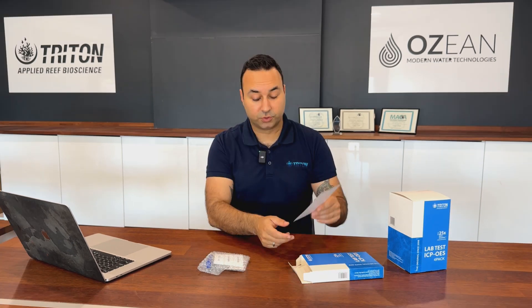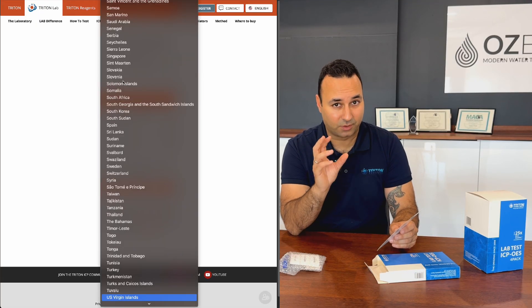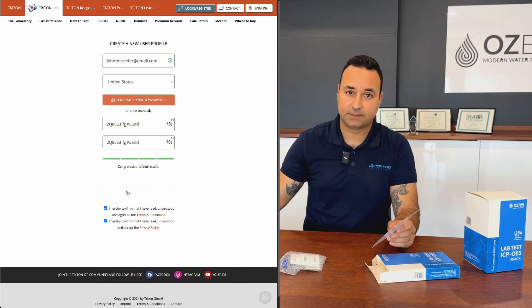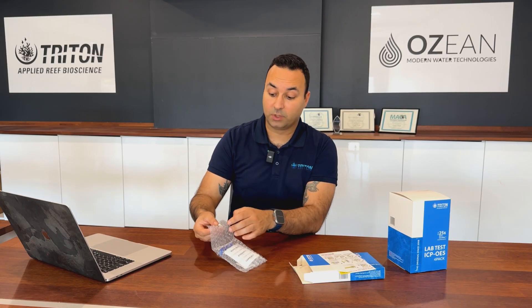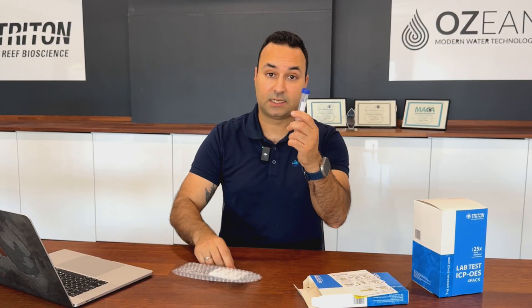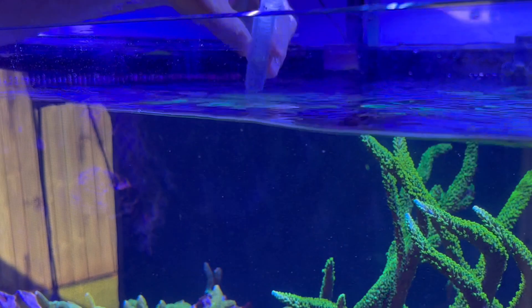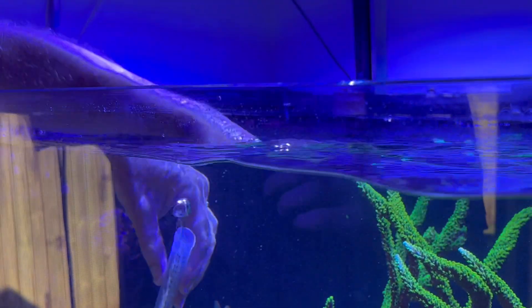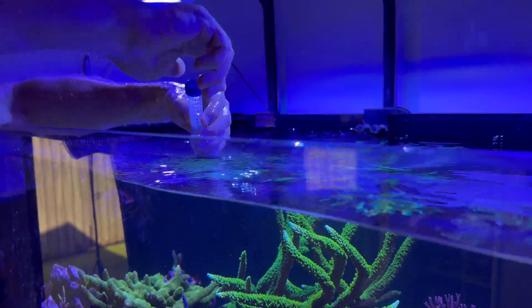The manual covers two key things: how to take a water sample and the registration part, where you need an online account with us. To take a water sample, take the vials out, open them, go to your aquarium, and flush three times. On the fourth fill you take the actual sample, put the lid on, and it's ready to go.